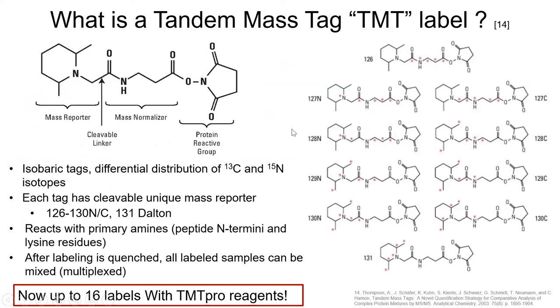Okay, so what is a tandem mass tag or TMT label? Like Dr. Wadratne covered, these are isobaric tags. And so here's a generic schematic of a tag, while over here I have the set of 10 that you can buy from Thermo Fisher. And so they have the mass reporter labeled over here.